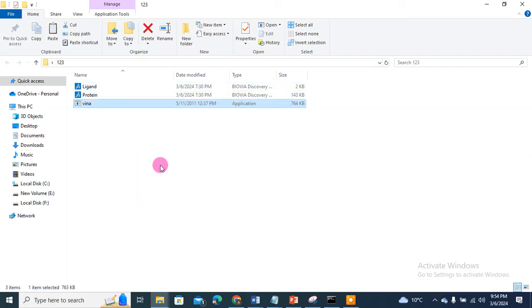Why do you need to copy it here? Because I know most of my listeners are not experts in computer science, so I'm trying my level best to make things easy for them. So this Vina program should be copied to the folder where your files are.